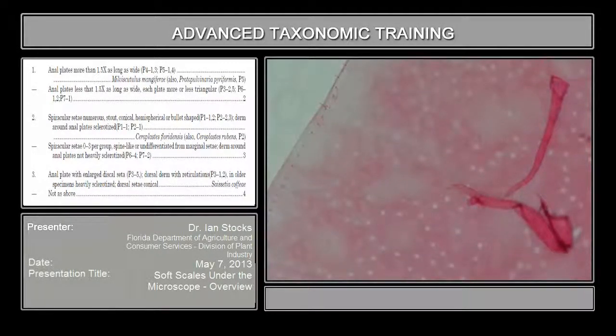These are on the ventral surface, and of course these animals are pretty much stuck down on their venter on the substrate. But they have to have some access for breathing, getting gases to them. So what happens is that there's a channel essentially that's formed just by the shape of the cuticle here called the spiracular furrow, and it joins up here with the actual spiracle where the gases then can diffuse.